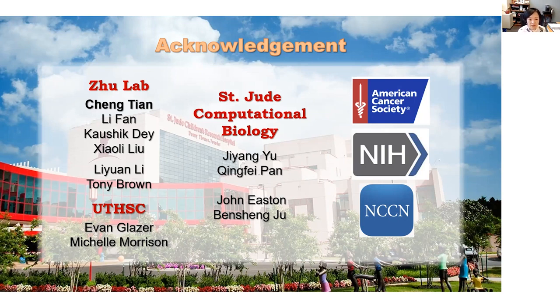What are the limitations of your models? Yeah, the models are in vitro models. The spheroids can never really model the cellular architecture that we see in vivo. The good thing is that we can add different cell types there, but for how they organize together, how they form cell organization, there are a lot of things that we cannot control. One thing I'd like to point out is we cannot model endothelial cells in this model.